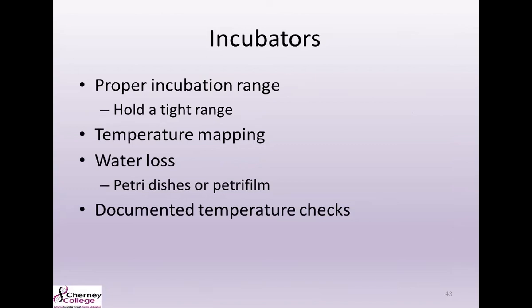So what I'm talking about there is water loss. You want to make sure that the plates that you put in the incubator aren't going to dry out. When they dry out, they're difficult to read. The bacteria won't grow properly. So you're going to want to make sure that you look into water loss as well as the temperature mapping.